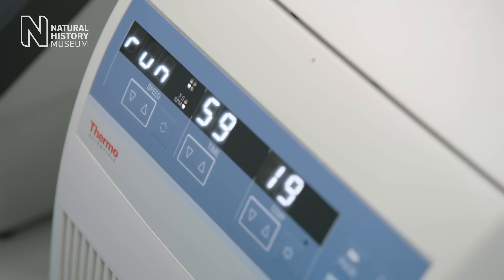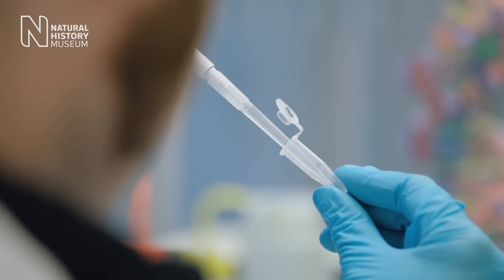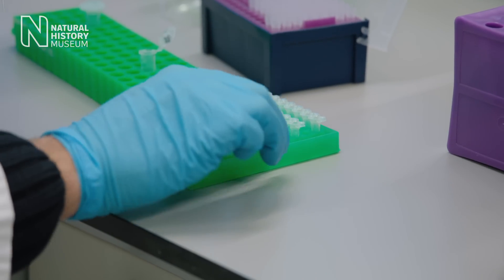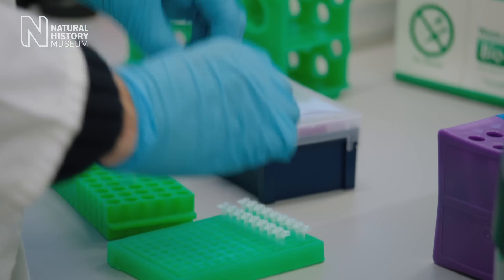We have to generate a high number of copies of a specific section in the DNA of all the organisms in our samples to have enough material for the sequencing. The PCR machine exposes the DNA to a repeated sequence of different temperatures, initiating different parts of the reaction.